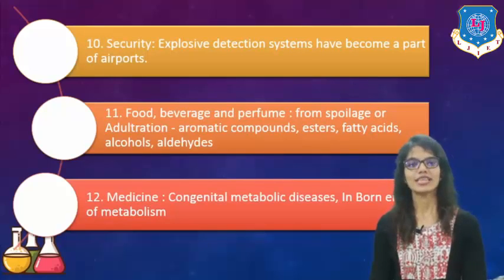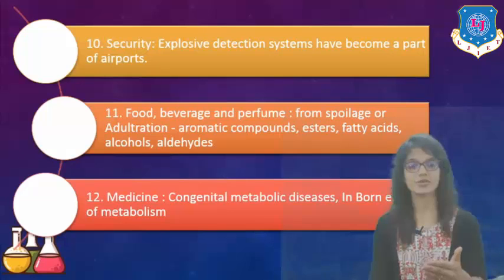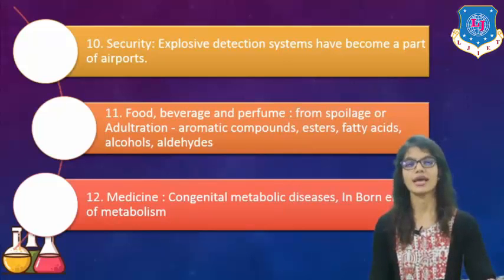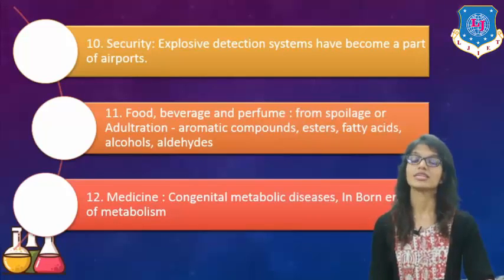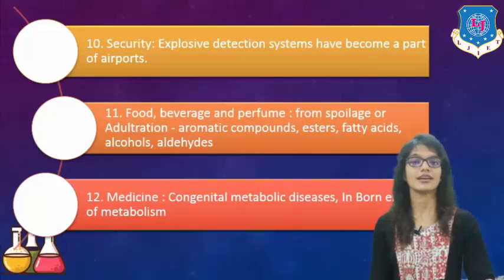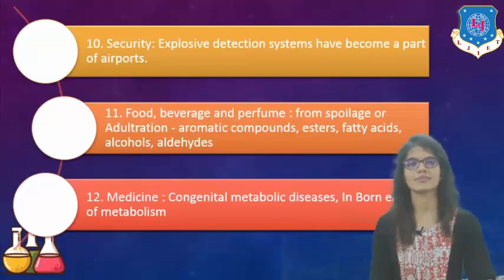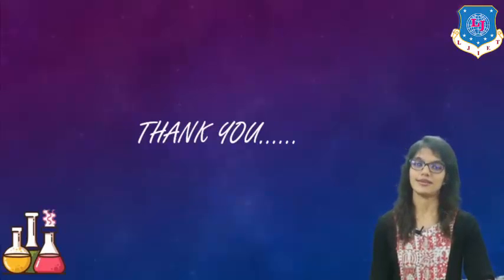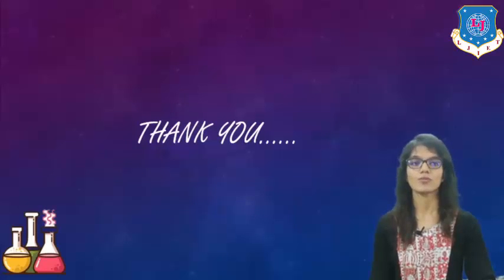Along with that, food and beverages and perfumes, those kinds of industries also involve the analysis of substances using mass spectrometry. And last but not the least, it has a wide application in the medical field, which helps in the identification of inborn or birth metabolic diseases, and helps find out which kind of disease is there. This is all about mass spectrometry.